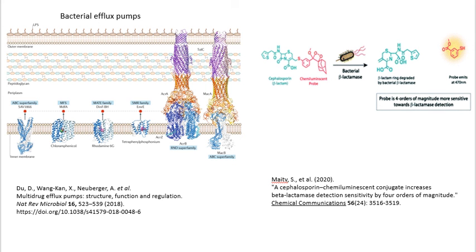As the typical method of bacterial beta-lactam resistance is the expression of beta-lactamases, which were not found to be present in any sample, I proposed that the increase in biofilm-associated proteins, the decrease in DNA replication and cell division proteins, and increase of proteins potentially utilising a different pathway for peptidoglycan linking were the general mechanisms of the treatment E. coli's ampicillin resistance.